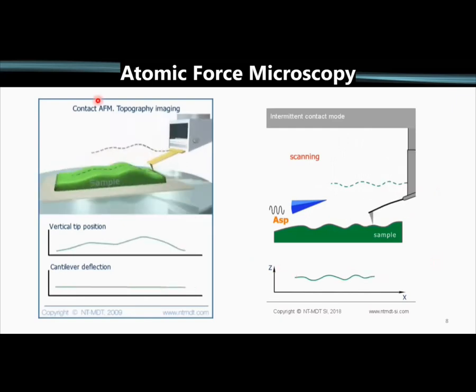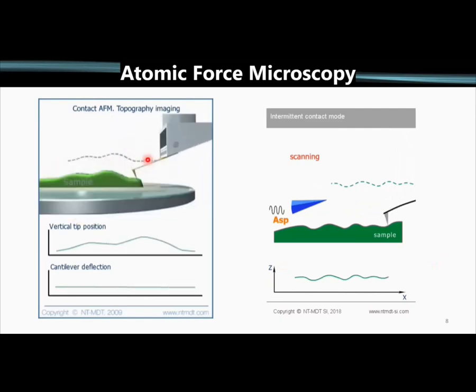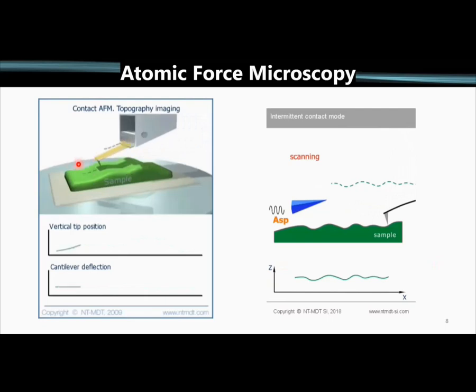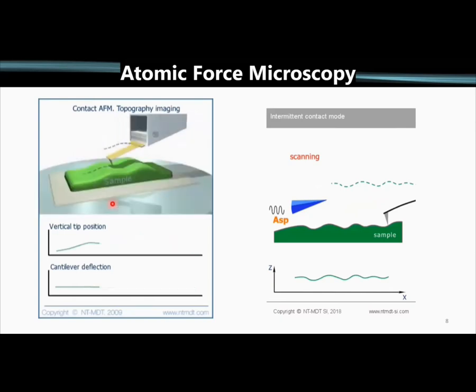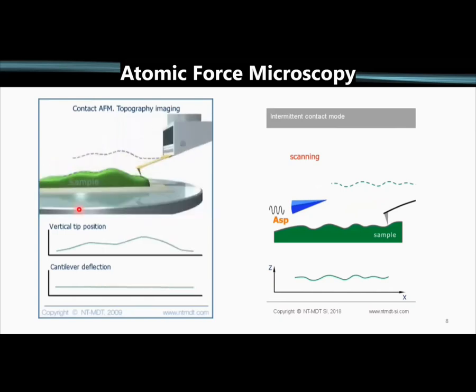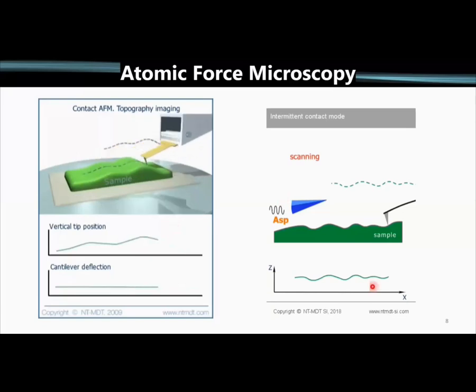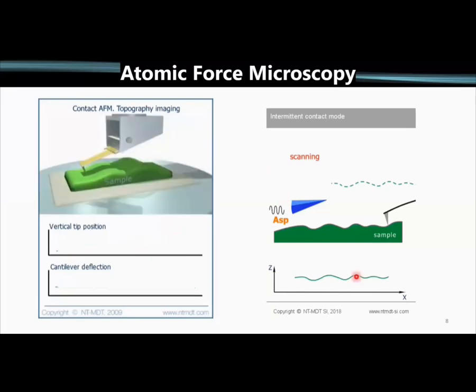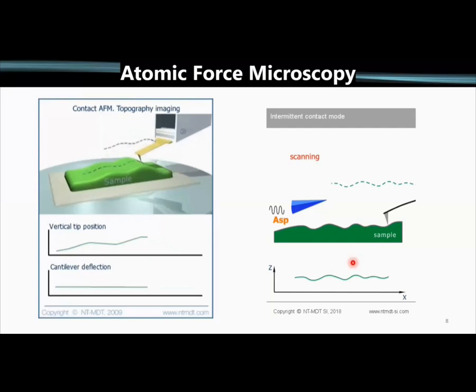Contact mode AFM can also be used with a conducting cantilever. While we're in contact with the surface, we can be measuring conductivity or current. Contact mode is what we use for piezoresponse force microscopy, and we saw some nice examples of PFM in the first lecture by Dimitri this morning. With amplitude modulation and other dynamic modes, that's where we would use techniques like EFM and scanning Kelvin probe, or Kelvin probe force microscopy.